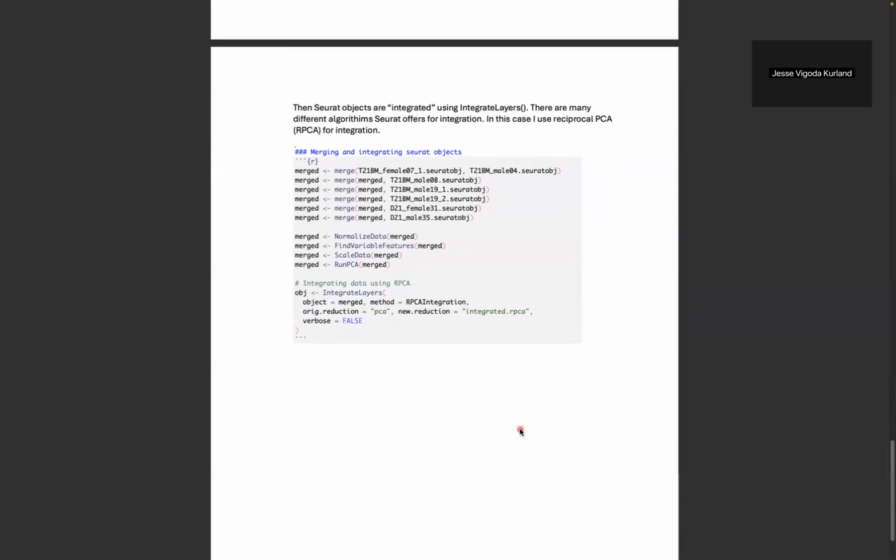And that's the end of this first day. Tomorrow we will get into the actual UMAP clustering, the dimensional reduction, the initial attempts at identifying different cell types, and doing differential expression across different cell populations. And then after that, you'll go into a more in-depth analysis.